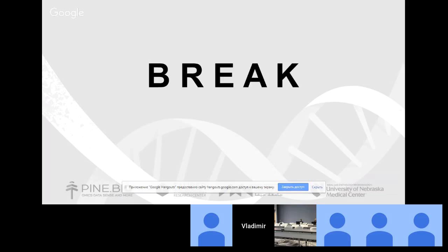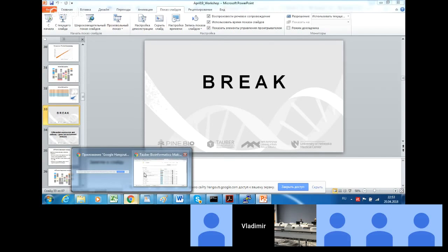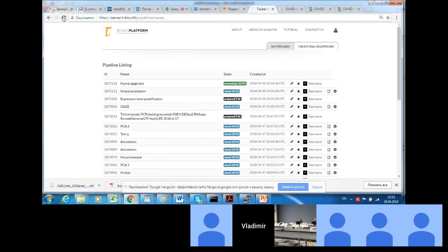It also provides us the list of pathways enriched by our differentially expressed genes, and also illustrations of the map of genes in these pathways that have differential expression. For example, currently, when we have a break, let us look at the progress we have here.